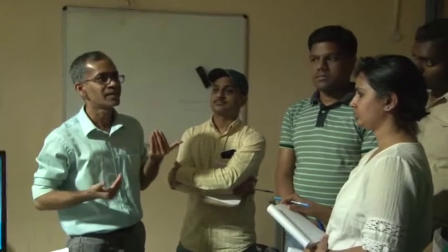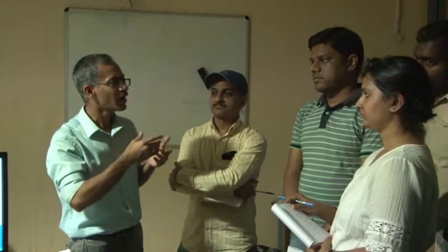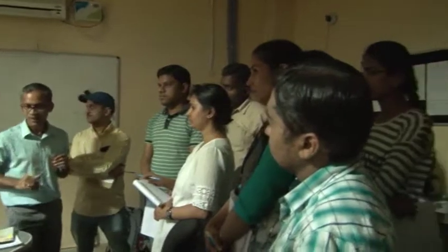Now, the second step is that we are going to see how to align the microscope, these few steps that I discussed. But before that, again, whenever you have a question, I think you should just feel free to ask.